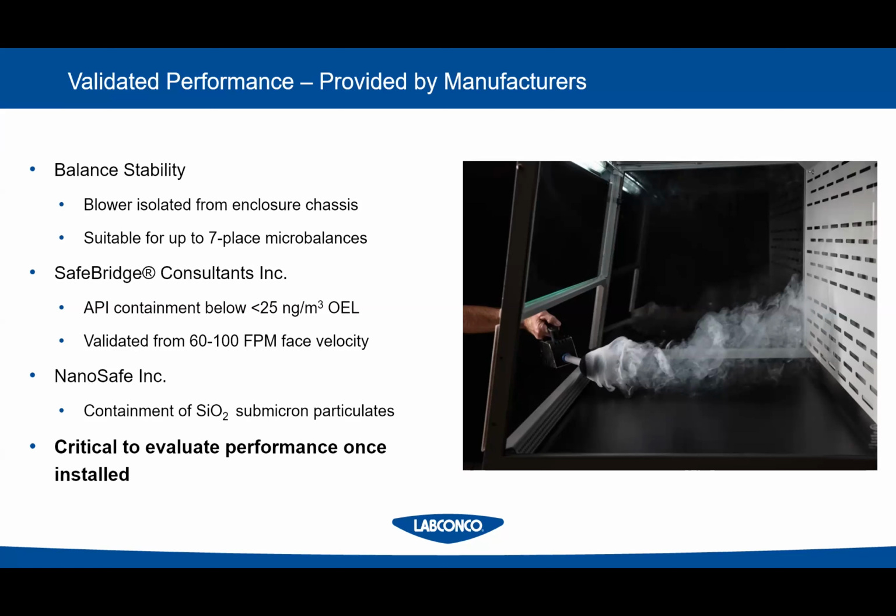And then I would like to say it's critical to evaluate the performance of these once it's installed. How your validation methods work, what you're doing, really comes down to a risk assessment, right? If you have somebody weighing naproxen sodium in a lab, or salt or whatever, and they're just trying to keep it out of the air, that's going to be a different validation performance than what we're going to do with somebody in a crime lab weighing fentanyl, right? They're also going to have different training to handle those different chemicals, right? So all of this comes into play.